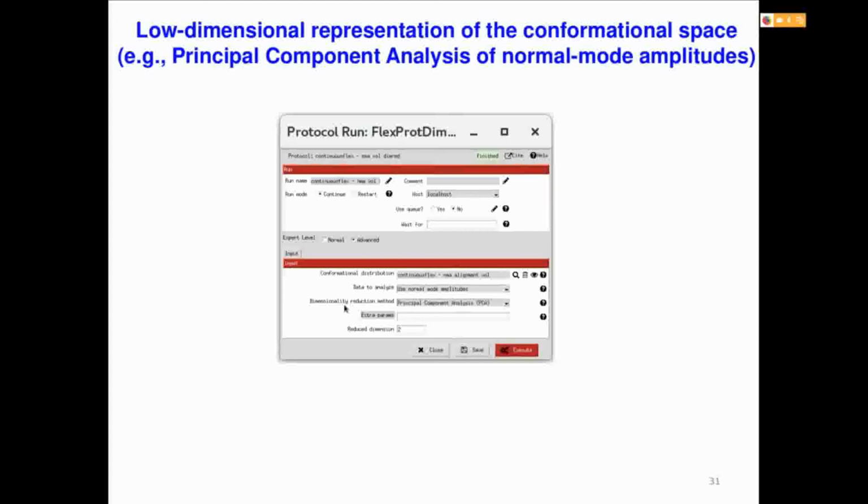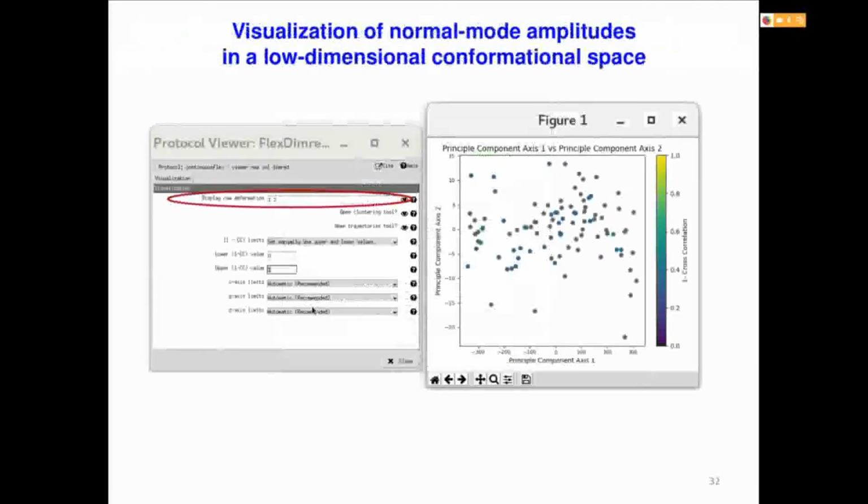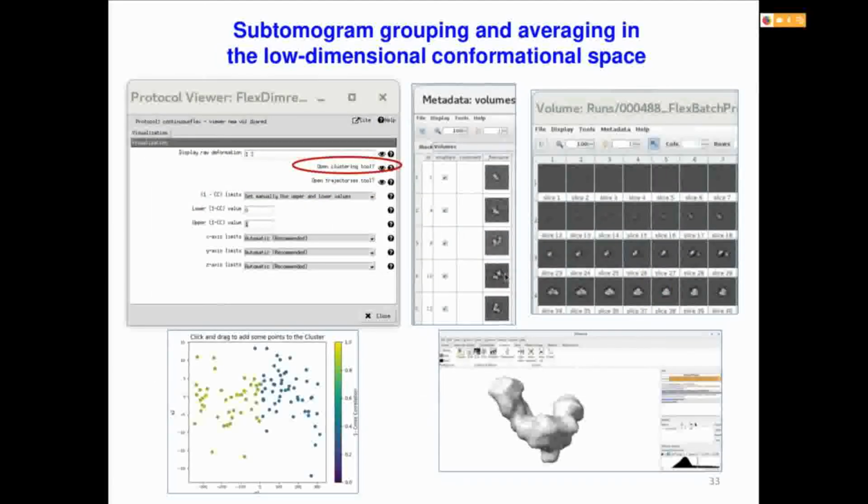This is the dimension reduction, but I'm reminding you again here because once you got this display in the reduced dimension space, there is a little difference with respect to HEMNMA.